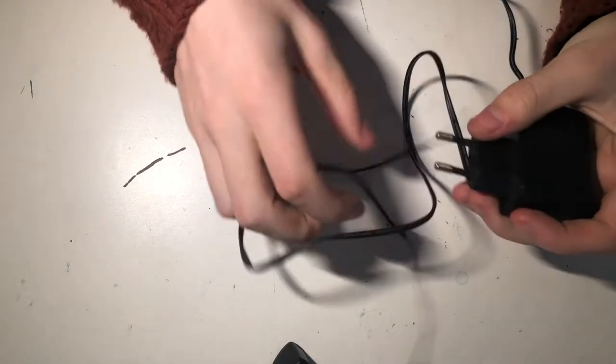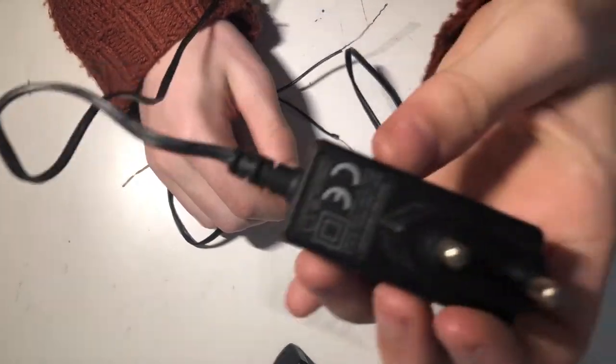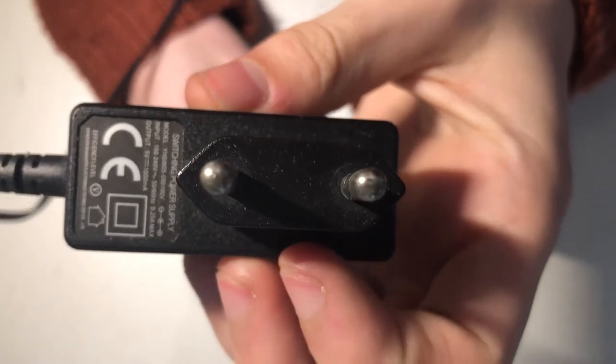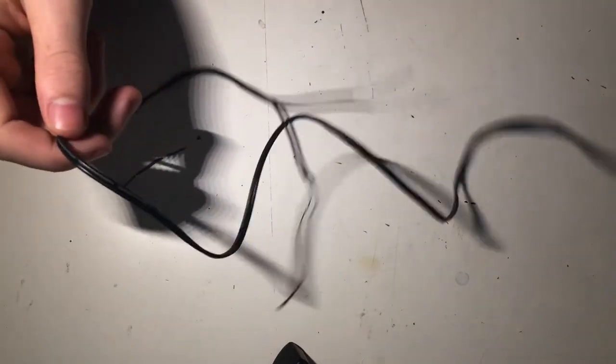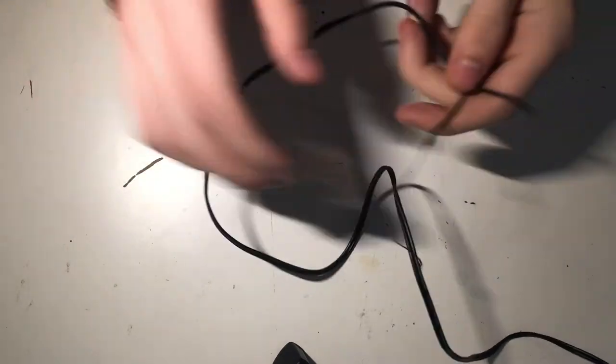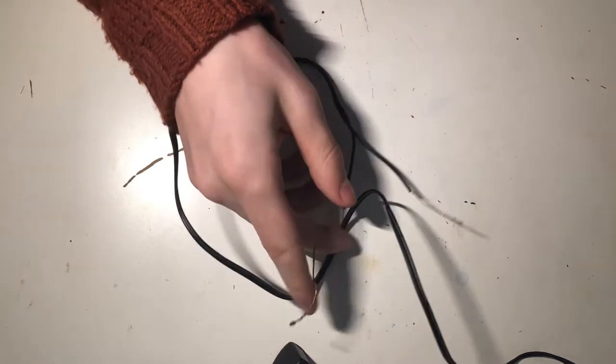Today I'm going to make sulfuric acid from copper sulfate and electricity. My source of electricity is one of those wall adapters. I exposed the two wires so there's copper exposed and it makes good contact. But you can't just use the copper wire, because at the anode it will dissolve the copper back and make your starting product again — copper sulfate — instead of making sulfuric acid.